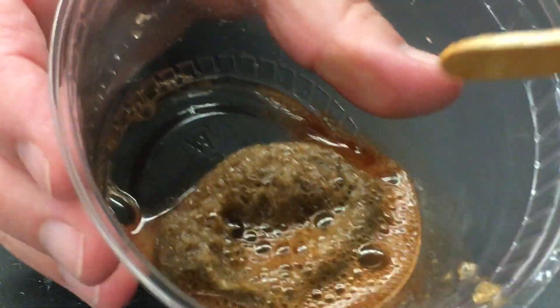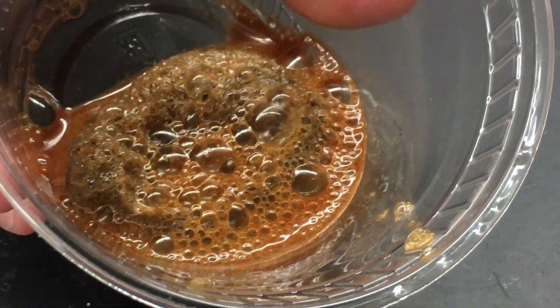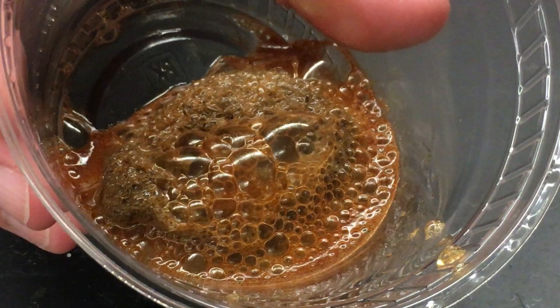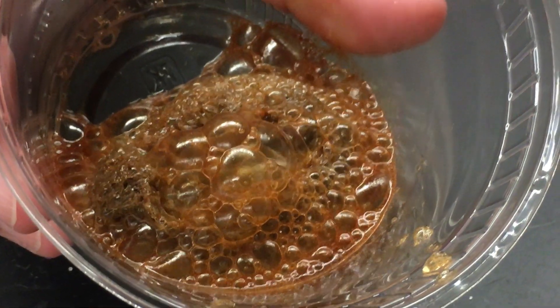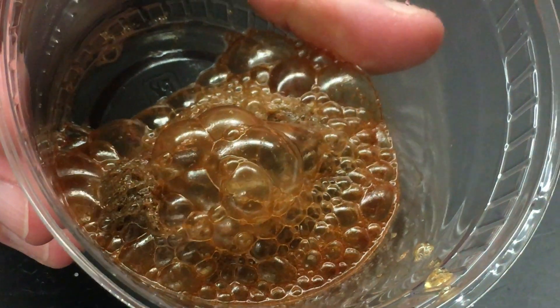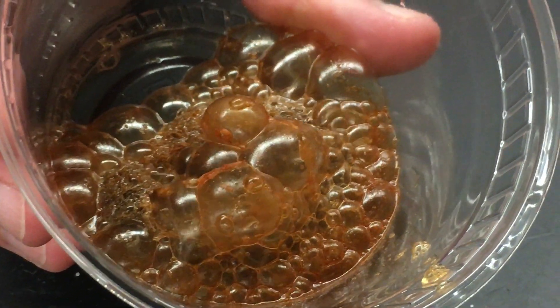But look right there — look at the bubbles forming. And I can hear the bubbles pop. So we know some kind of gas is being formed, along with the rust.